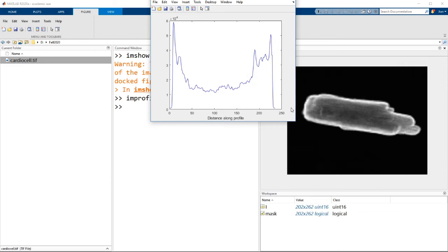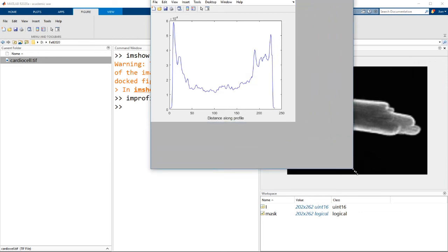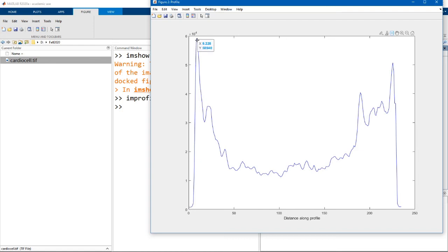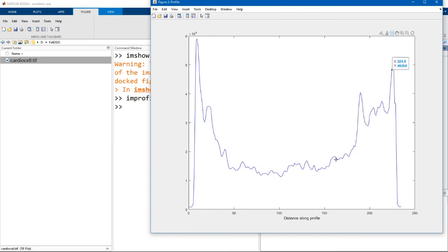MATLAB will now pop up a new window showing you the intensity or the pixel values along the line that you drew. Now looking at this intensity profile, hopefully it's clear to you that the low values here are the background and all the high pixel values in this region are the cell. We could probably pick an intensity threshold around this range of values here and get a pretty decent mask.